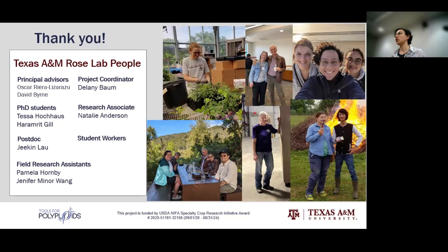Yeah, we need to check, because one thing that I realized about Ploidy is, and I was trying to fix that, that if we have different batches of analysis, like for example here I had the French and the R data, I couldn't use one to reference the other. If it was made with these samples, I need to use the references that were in the same array. So I don't know if it's related, but we need to explore.